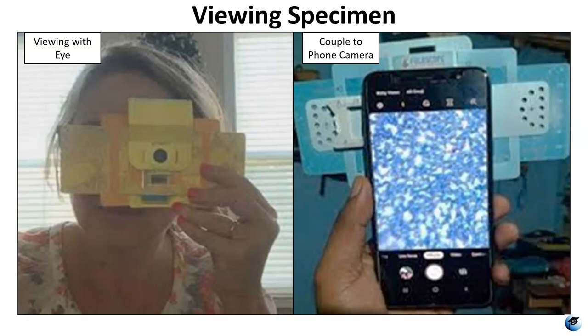Once you have your slide in place you can view with your eye, or you can use the phone coupler to connect it to the camera on your phone. I find that this works a lot better than trying to look at it with your eye, because the camera gives you something bigger to look at. Instead of looking through a little peephole you have a whole screen. And once you find something with your phone camera you can take pictures for your lab reports, zoom in, or take video.